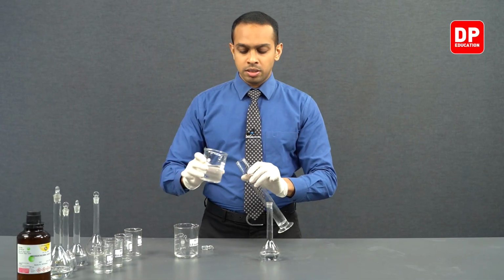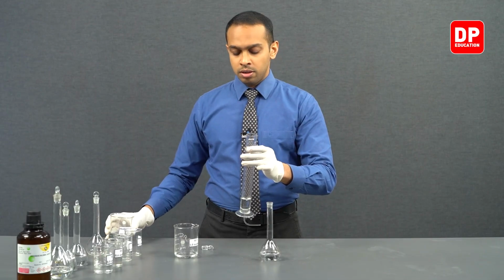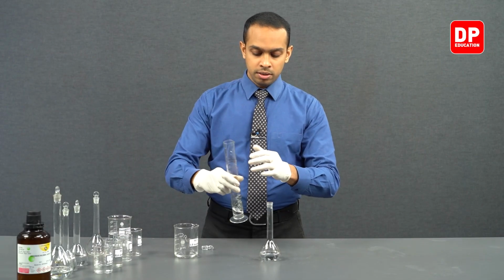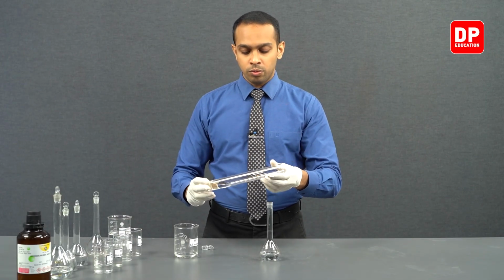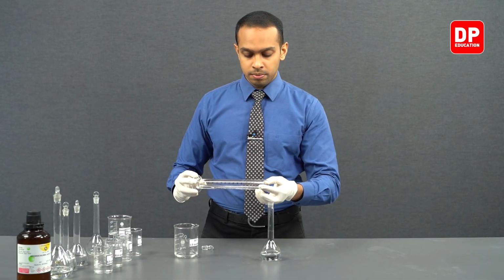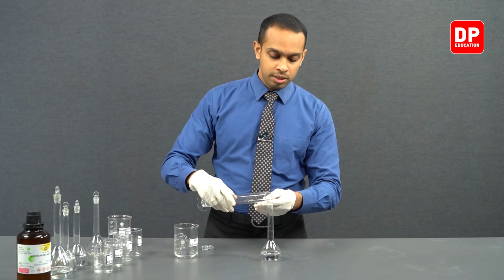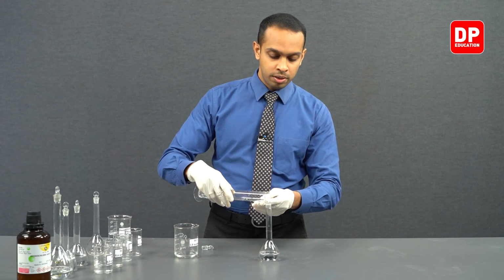Like we did in the previous instances, we can wash our measuring cylinder with some distilled water and then transfer that amount of distilled water into our volumetric flask as well.